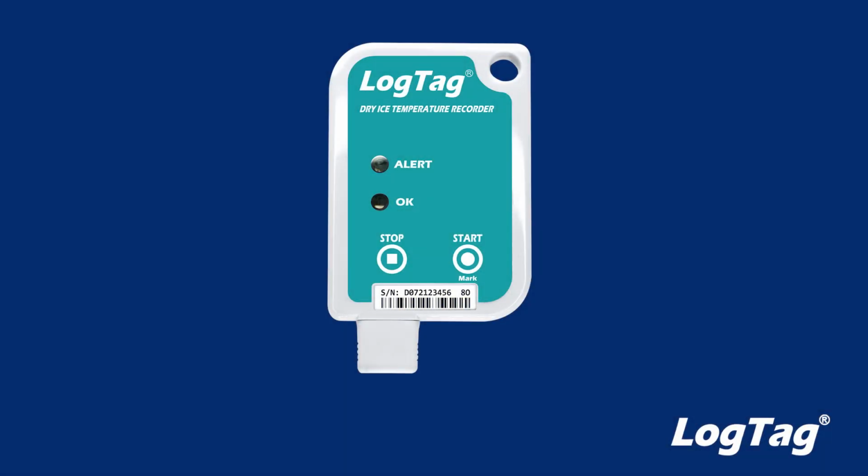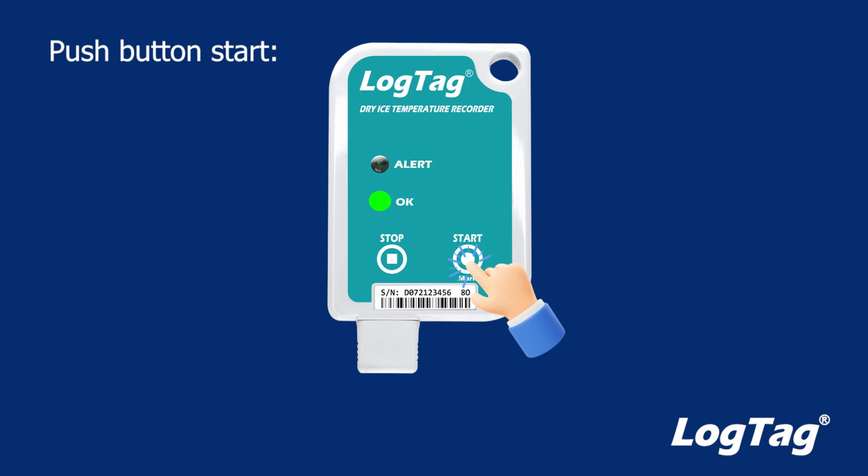The logger can start in several ways. Firstly, push button start. This begins recording when the start button is pressed. To start the logger via this method, press and hold the start button until the red and green LEDs start flashing. Release when the LED sequence ends.